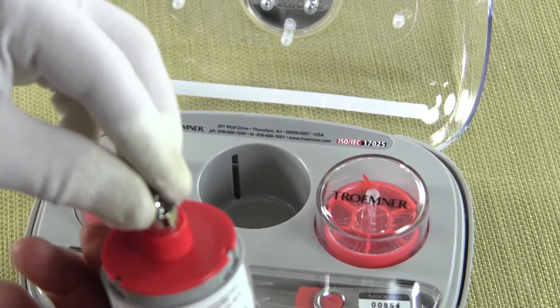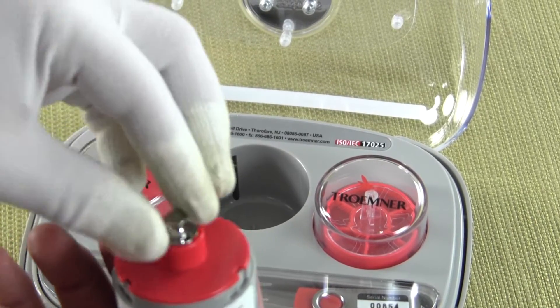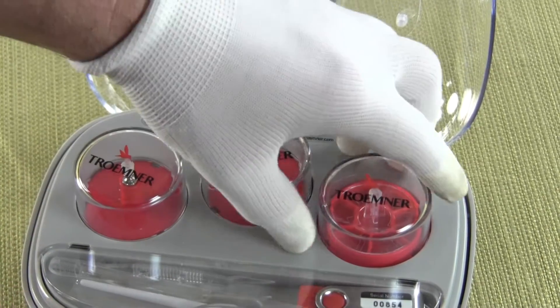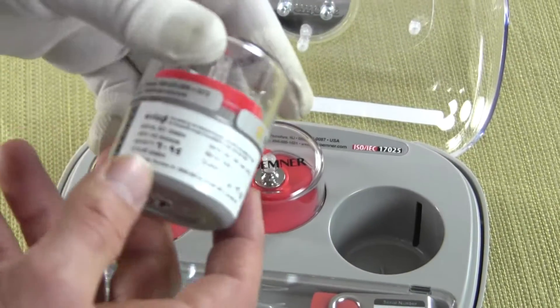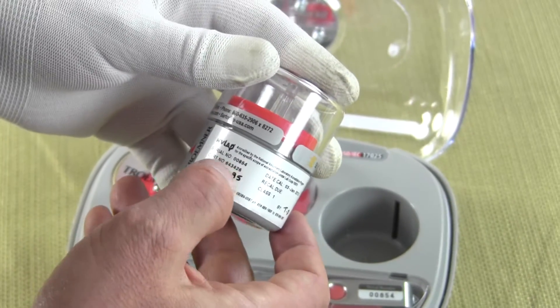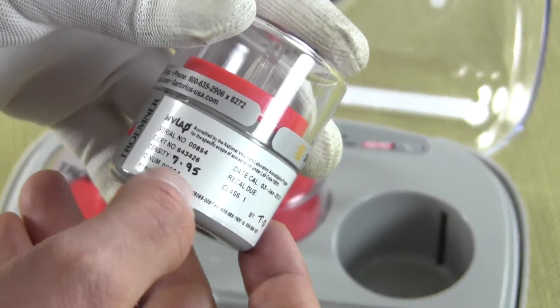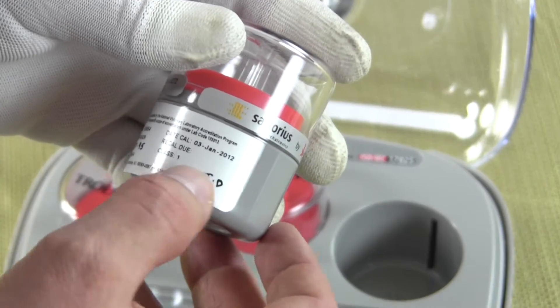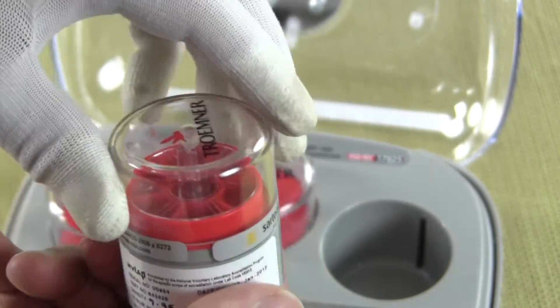This 20 gram is a class 1 weight. The third weight in the set is a leaf weight — this particular leaf weight is 20 milligrams. Again we can see it has a serial number, CERT number, the density of the material, the date the CAL was done, and the operator.